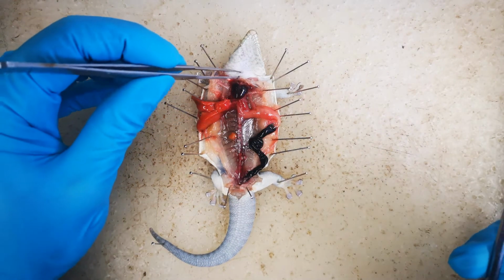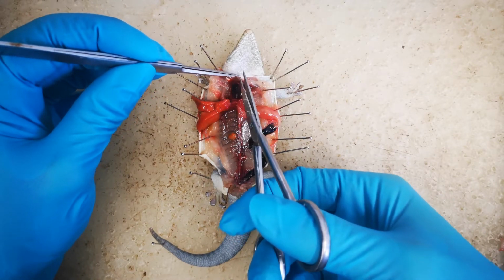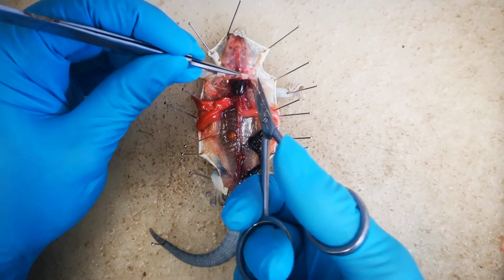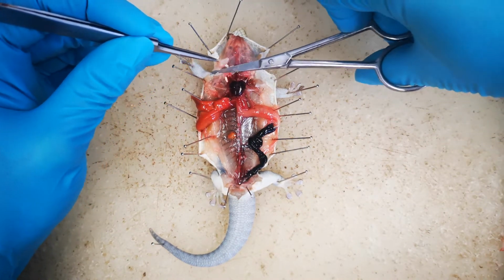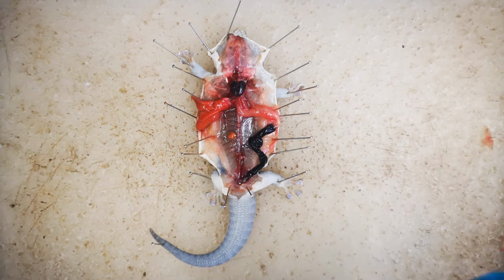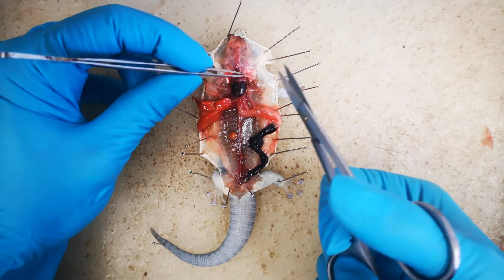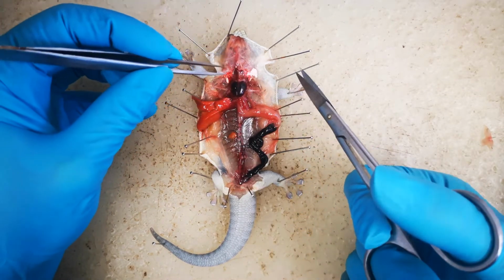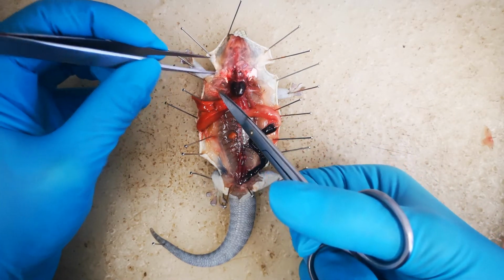Now we examine the gular region of the gecko. An incision is made along the chin so that the skin can be separated. Through the translucent muscular floor of the chin, we can make out the trachea and esophagus. In many reptiles, calcium sacs are present just behind the quadrate bone. These are used to help support bone development and by females also to produce eggs. The calcium is kept in a fluid solution so that when it is cut into, the bright white or pinkish white fluid escapes.